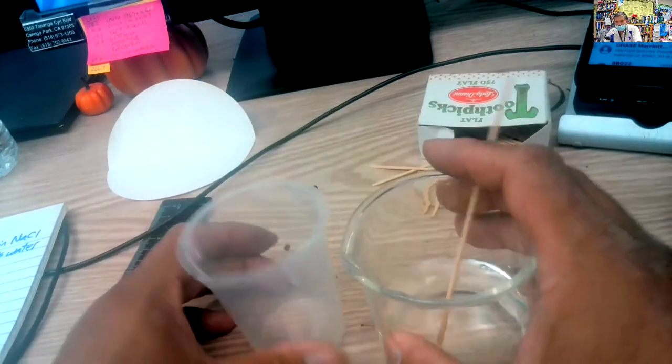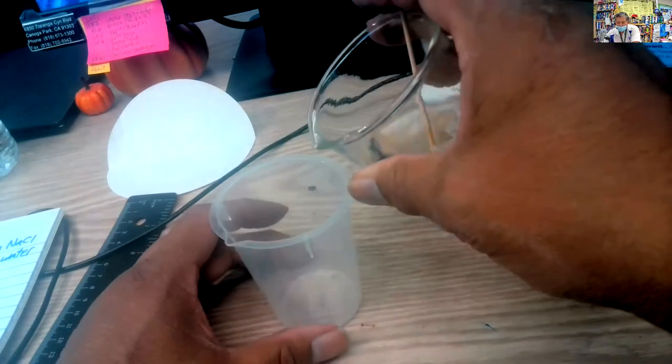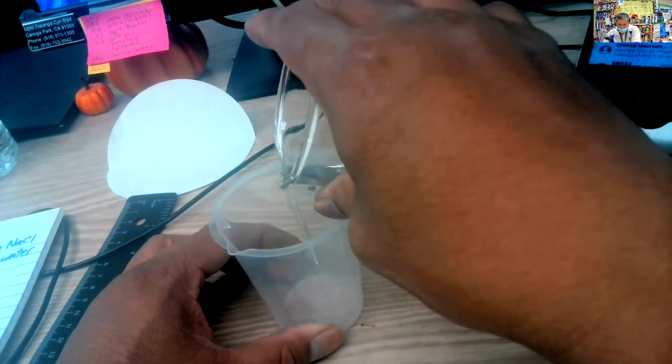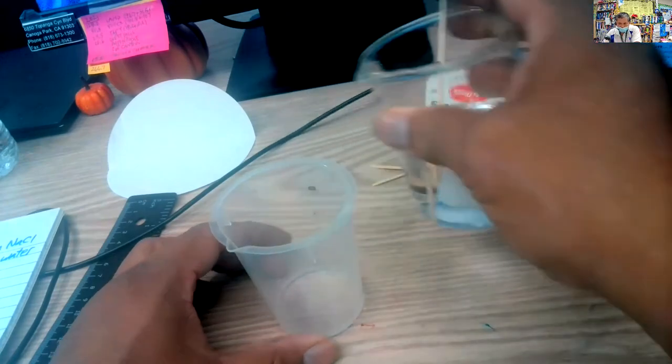I'm going to put this on the bottom of this beaker or cup. You could do this in a cup, because it doesn't have to be a scientific cup, but you have it, so you might as well use it. So there, I just lined the bottom of the beaker with the liquid like that. And then I'm going to take the paper that we made, that we just spotted, and I'm going to put that at the bottom of the cup.